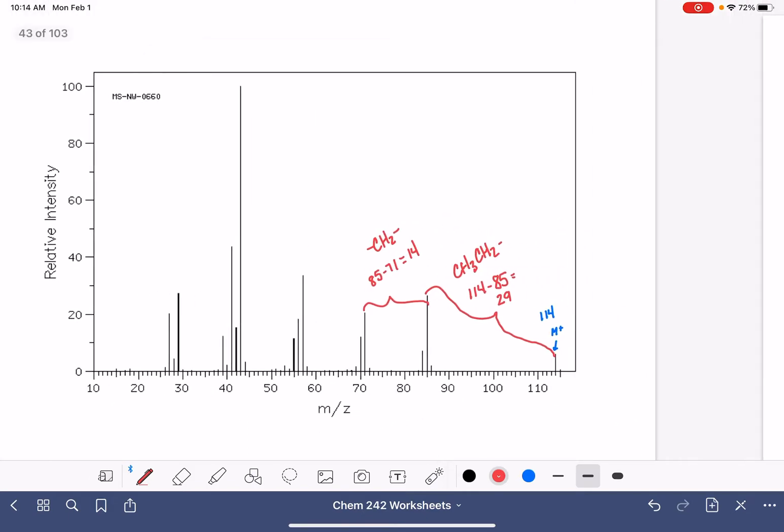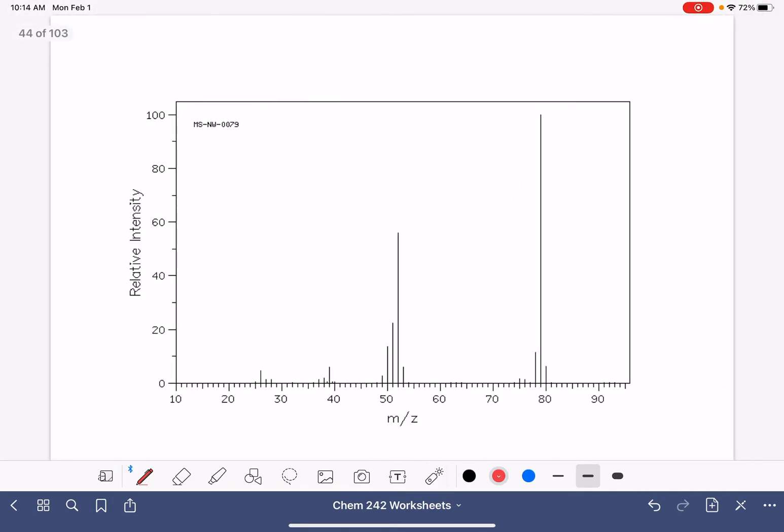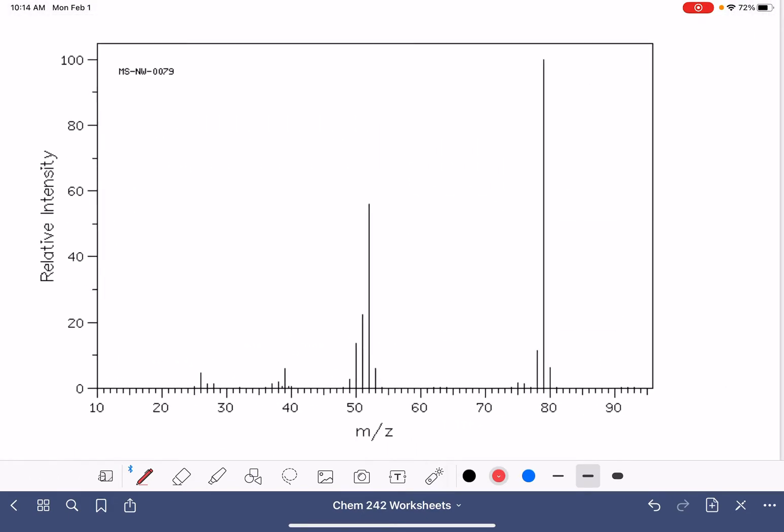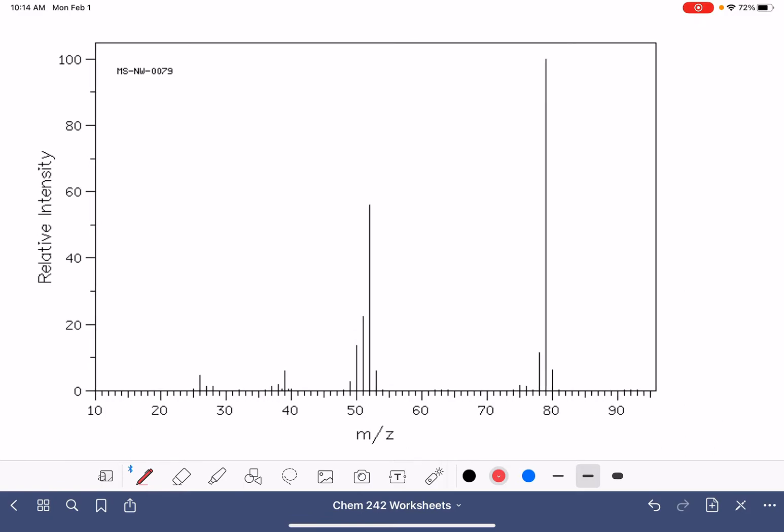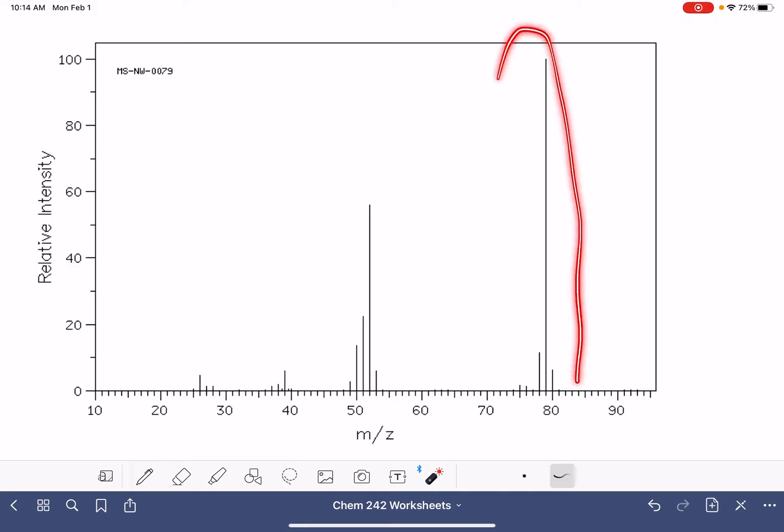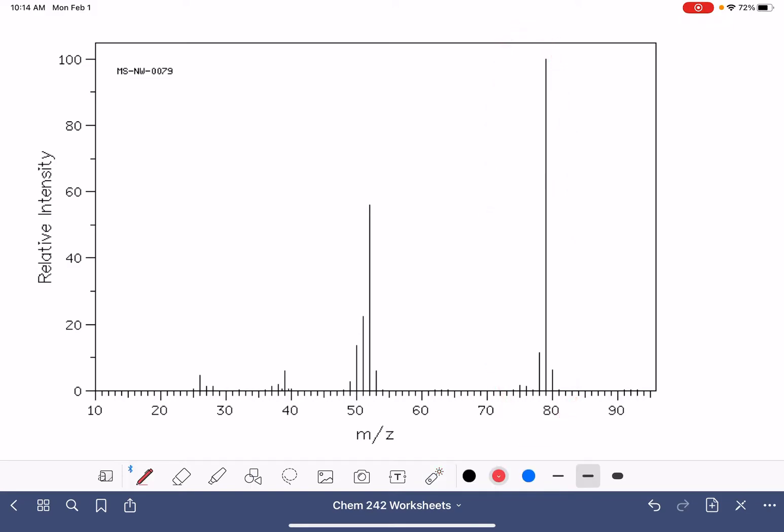Let's move to our next spectrum. This one, the M plus peak is the most abundant peak in the spectrum. Sometimes that happens. If we're looking on the right hand side, we want to find the peak that has the greatest abundance. So that's this guy right here. This is our M plus peak, and it corresponds to 79 grams per mole.